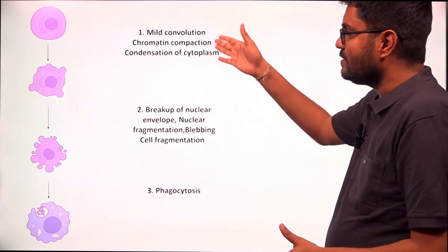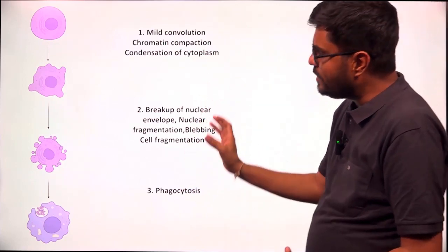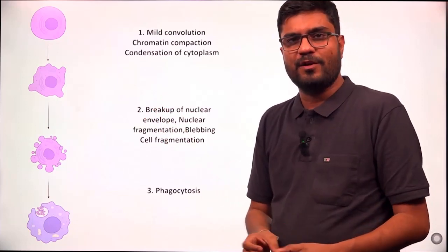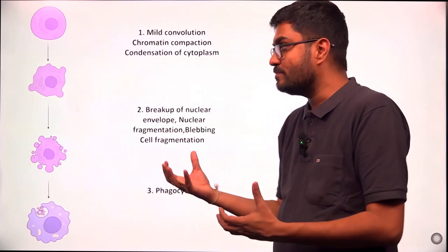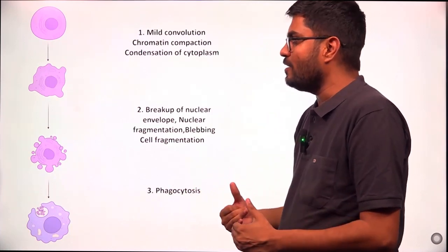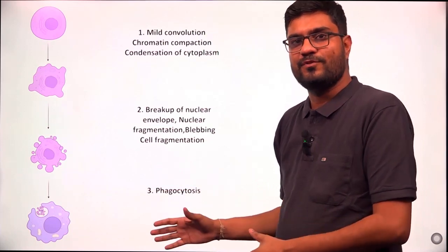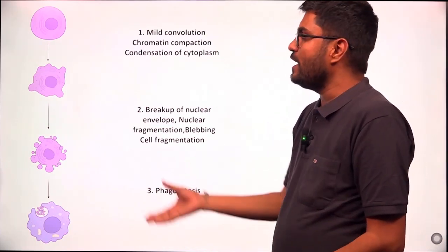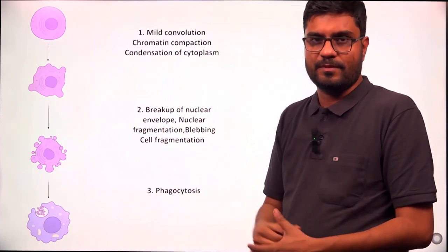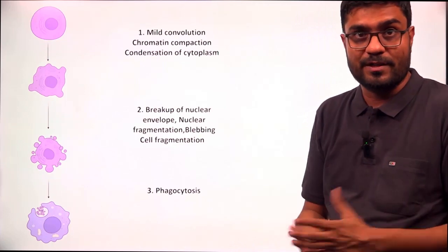So this is the basic flow of apoptosis, where so many proteins and so many different molecular mechanisms like the intrinsic pathway and extrinsic pathways are working. But right now we are not interested in learning the cell signaling and pathways of apoptosis. We are more interested in how we can use these symptoms of apoptosis to analyze apoptosis by the technique called flow cytometry.